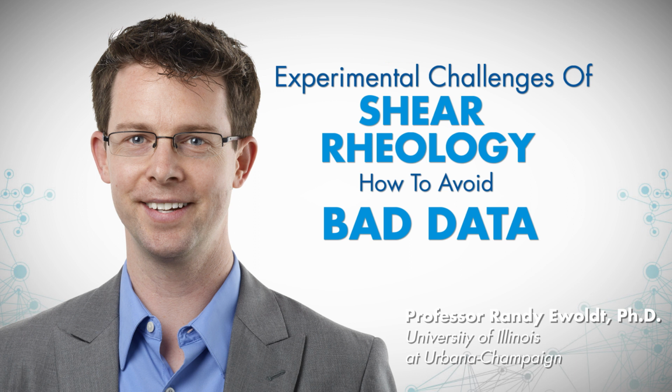I think based on time, we have time for just one more question, and that last question is on one of your favorite topics, slip. Is it possible to avoid or at least reduce the impacts of slip by using a slow application or a low torque value and a cone if you're trying to measure gels?